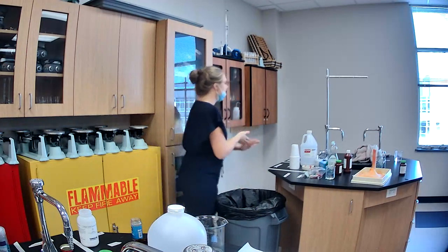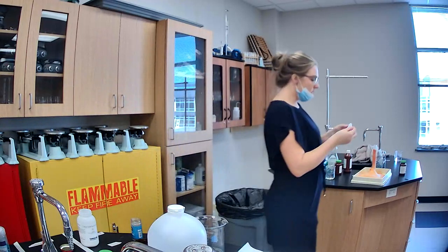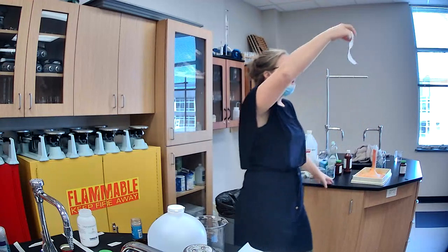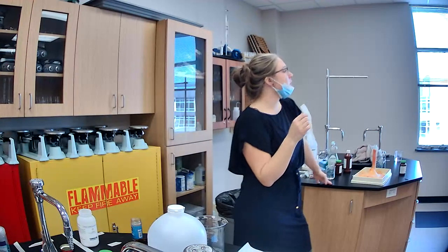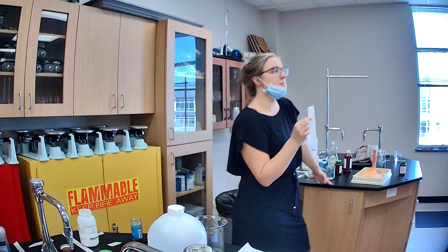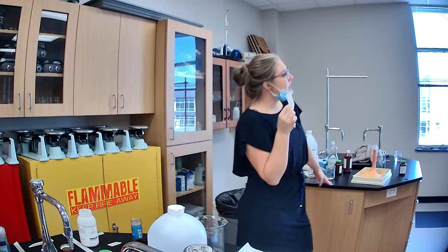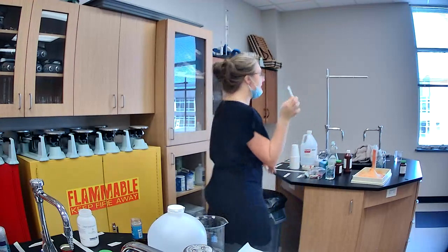Okay, our last one, I have some filter paper here. Coffee filter paper. What we're going to prove with this one is we're going to try and deconstruct black ink. Remember how we talked about black is a combination of all the different colors together? We're going to try and prove that.